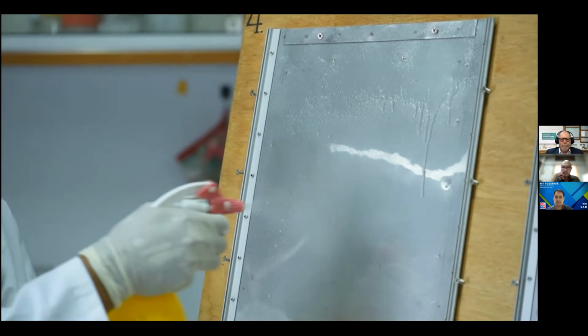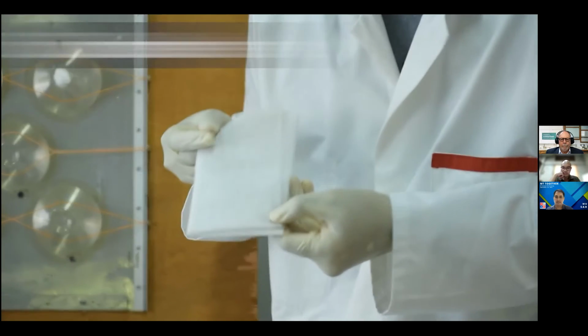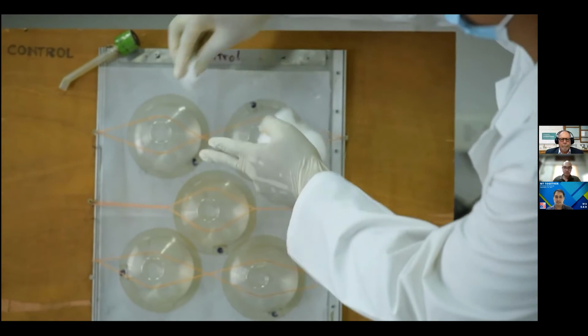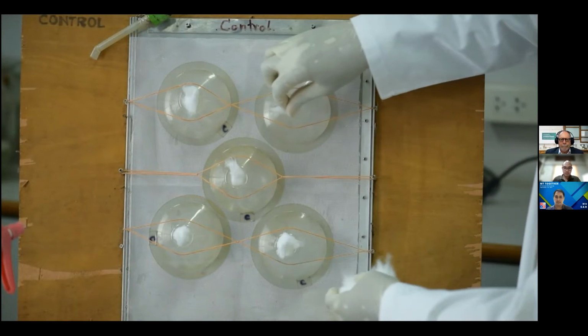Clean the treatment and control slides with 70% ethanol. This is the control net. Attach the plastic cone to the net like this. Close the open hole of the cone with cotton wool and do the same with all the cones.